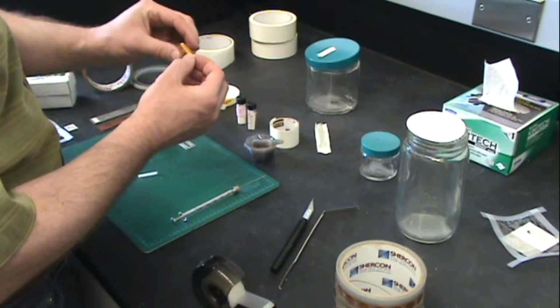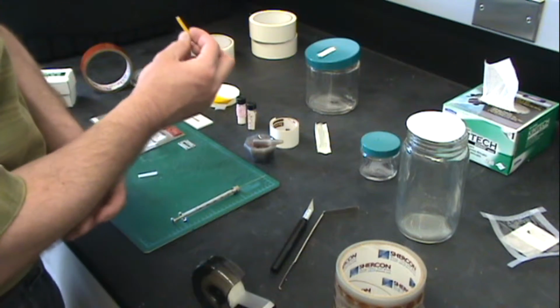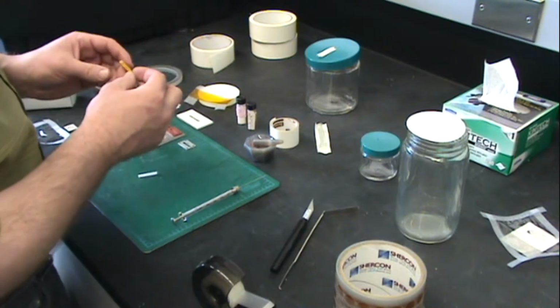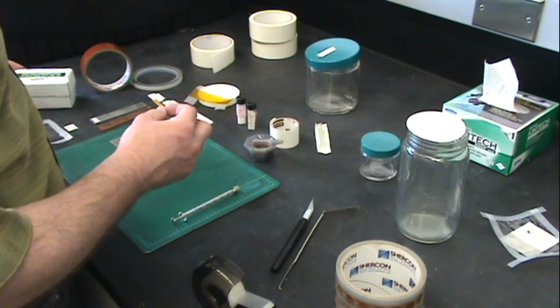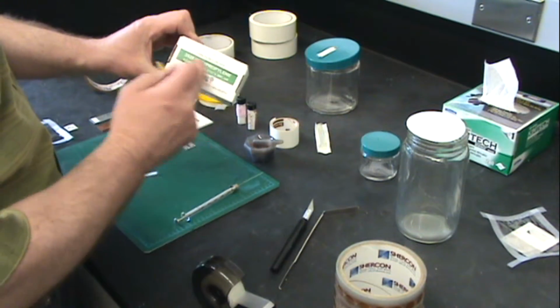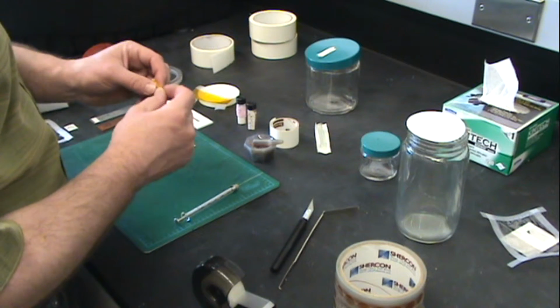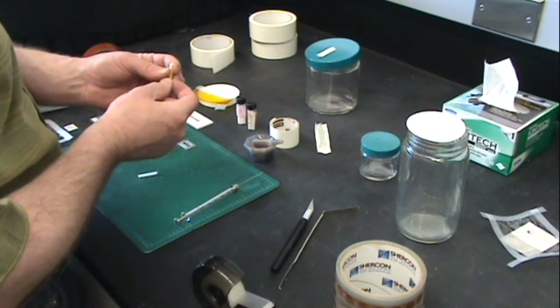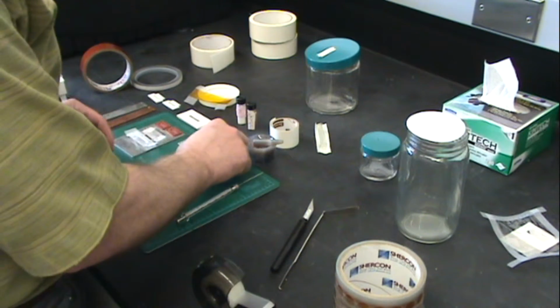Practically what you need to do is wrap the cell in a very thin tape or potentially the polypropylene window, the polypropylene film can be used as well. The reason why we generally use the tape, a very thin 1 mil or even thinner tape, is because you still need some mechanical stability when you load the sample cell with solution.